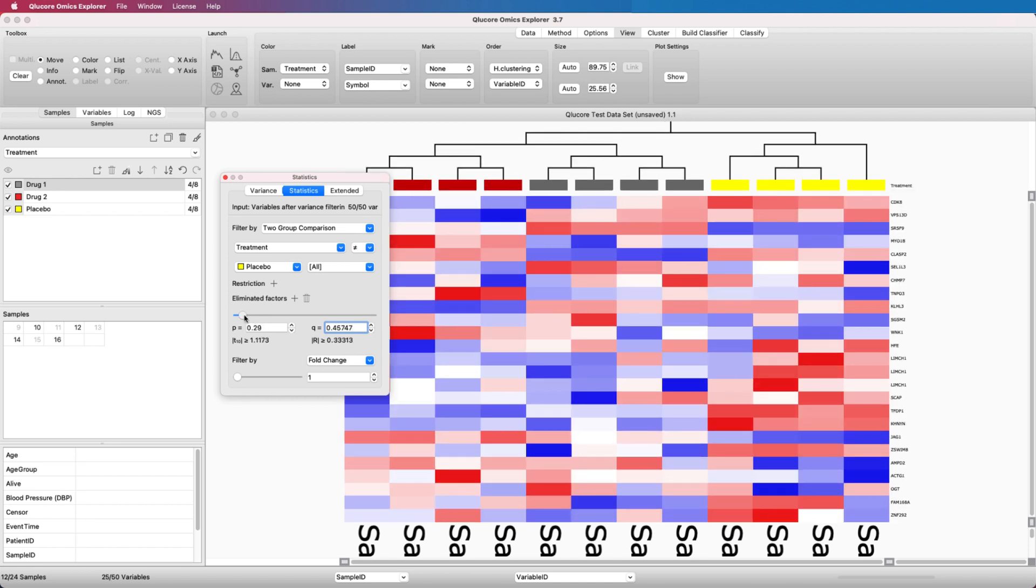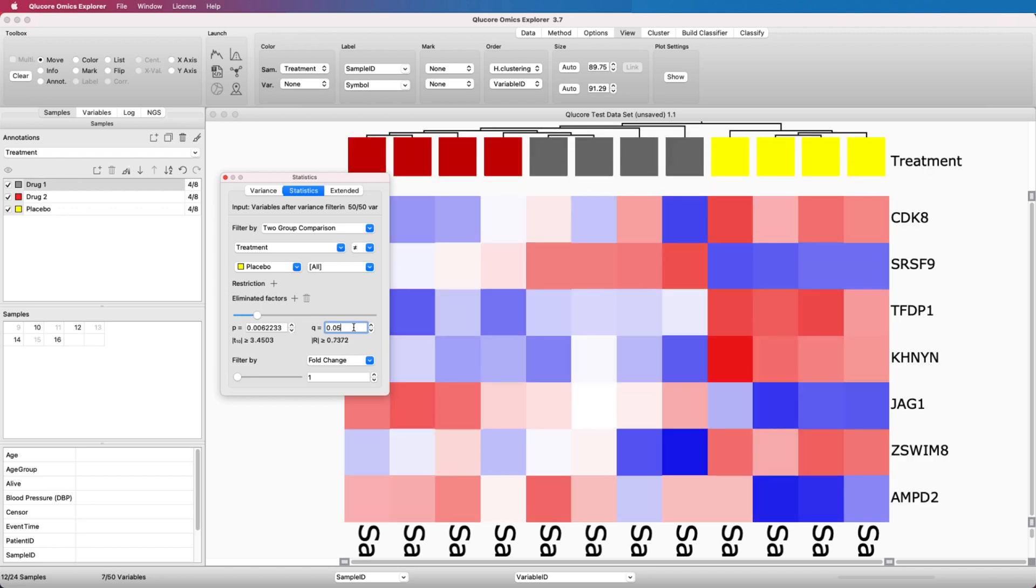The number of active variables is always presented in the lower left corner. A good methodology is to first select a cutoff that represents a relevant statistical significance. An example would be a QValue of 0.05. The exact cutoff will vary with your specific experiment and needs.